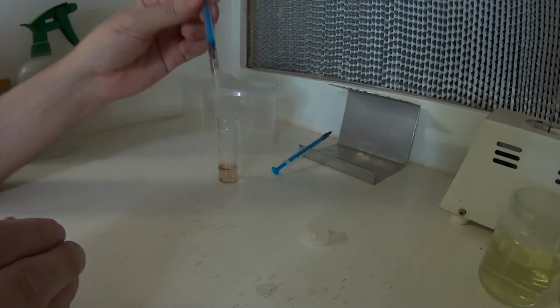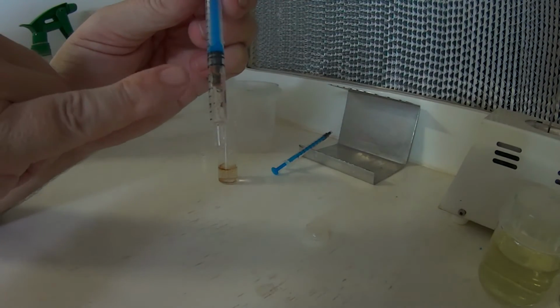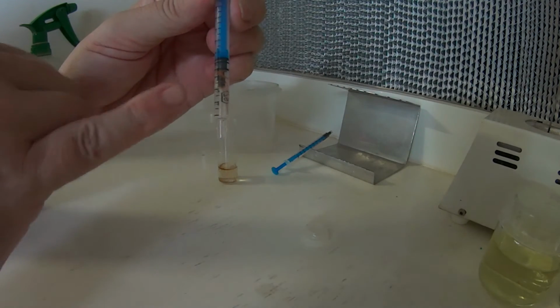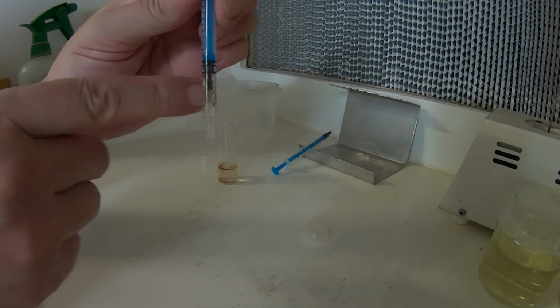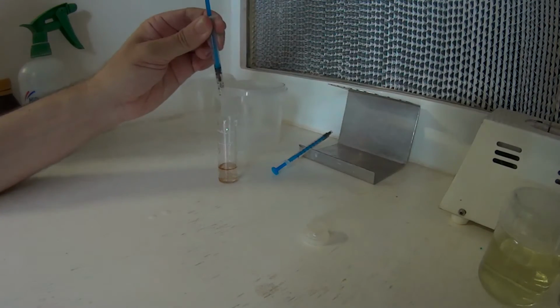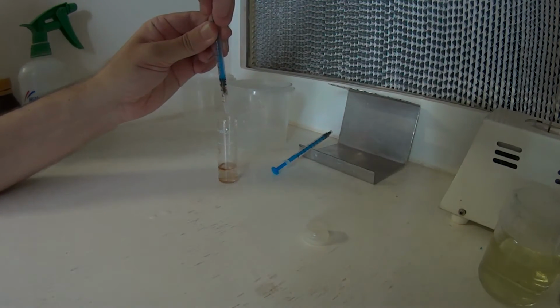Now, if you can see in there, a lot of our seed is gathered at the top here, so that's pretty good, that's what we want. And basically down here there's not too much seed, so we can get rid of a little bit more of that hydrogen peroxide in there. You can repeat this process a few times if you want.